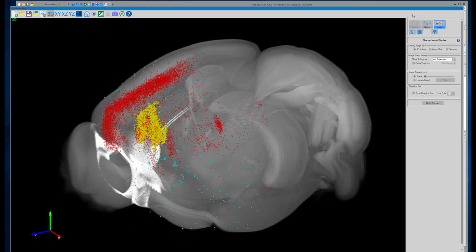The brain registration itself, the manual part of it, where you actually have to do something while you're at the computer, actually goes pretty fast, about half an hour or something like that. And then the registration itself takes between an hour to 2 hours. So if you add all of that up, we could process many brains doing just the NeuroInfo part. The real slow part is the imaging.